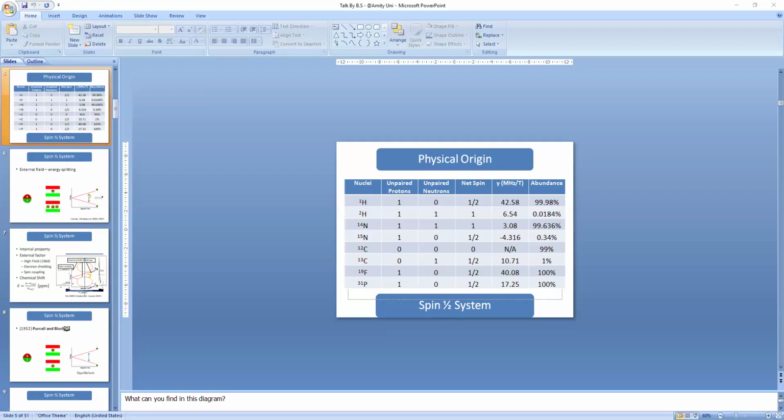So our resultant equilibrium magnetization, which was in the Z direction, shifts to the XY plane. And when this equilibrium is restored, then what happens? You can click and go to the next slide.